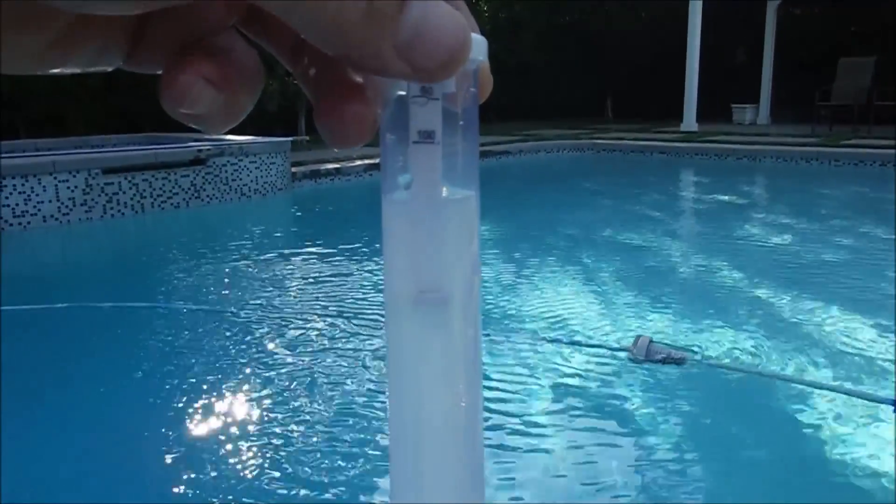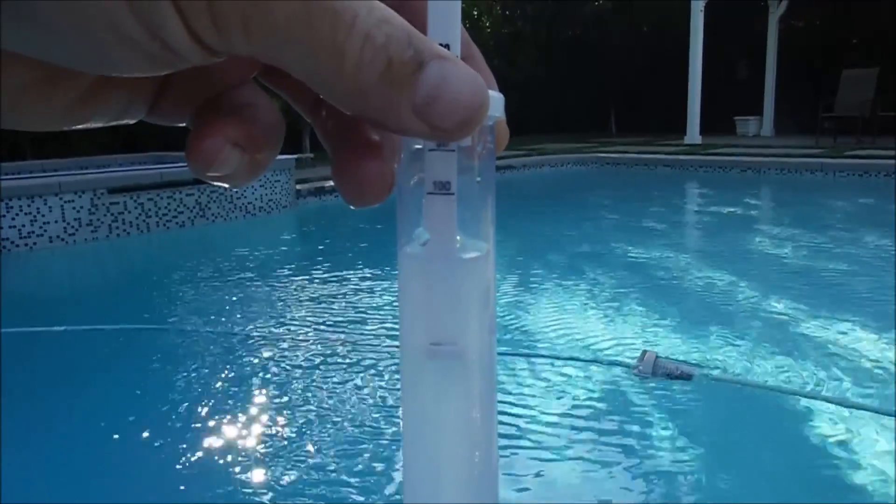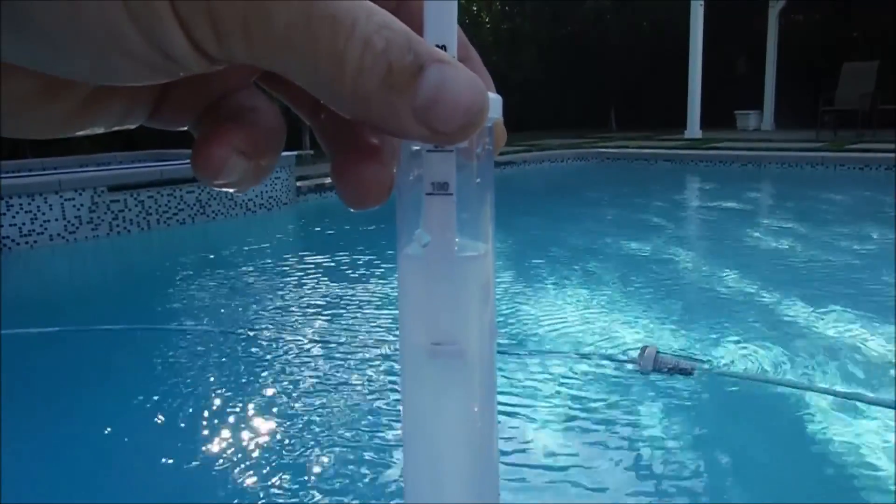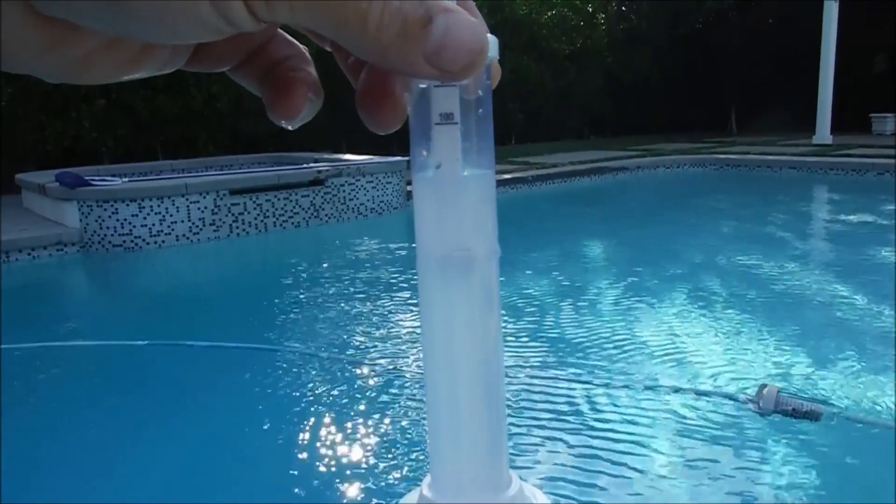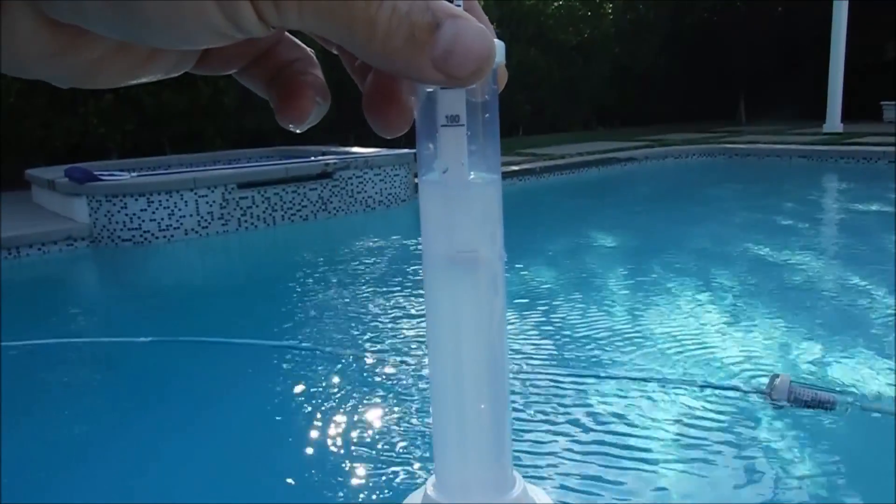If you're doing this test and the black dot disappears before it gets to the 100 parts per million mark, that means that the cyanuric acid level is above 100 parts per million. In that case go ahead and do the dilution test which is one part pool water, one part tap water.